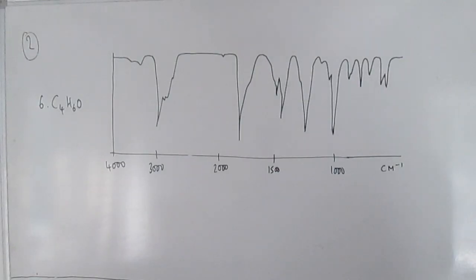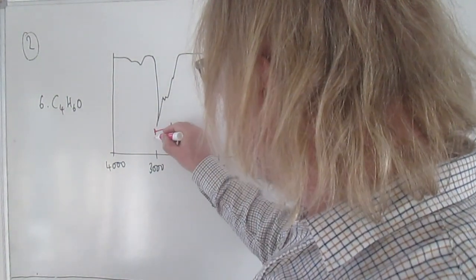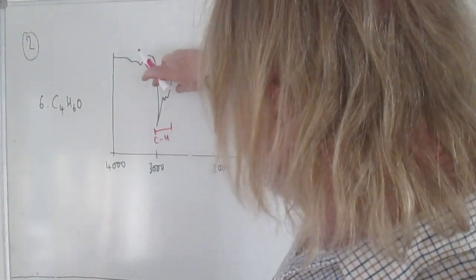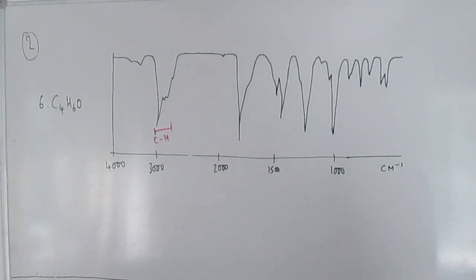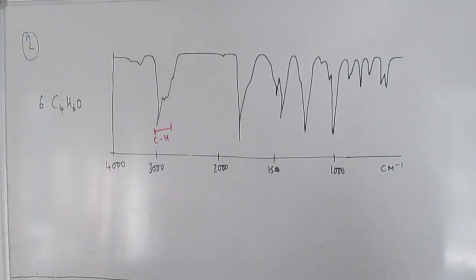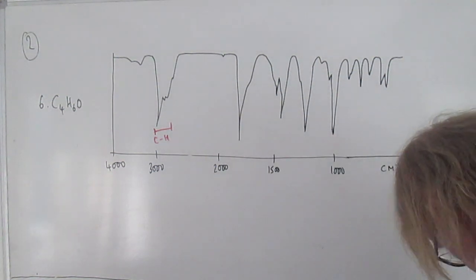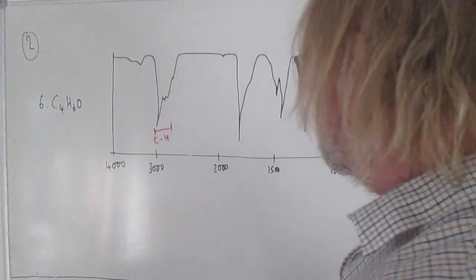In question 6, in terms of what we can see in the spectra, it's a similar story to the last one. We've got the CHs here, bunch of sharp peaks clustering around 3000. Always just say, yeah, those are the CHs, so we're not going to worry about those. But then the eye-catching one is the big, strong one in the middle there. So again, just do the check, make sure it's in the right place, but that looks very much like a carbonyl group.